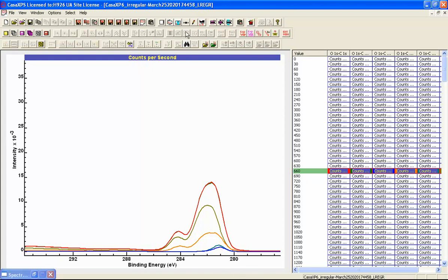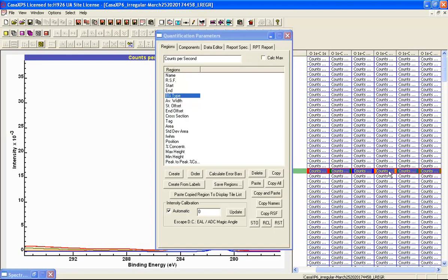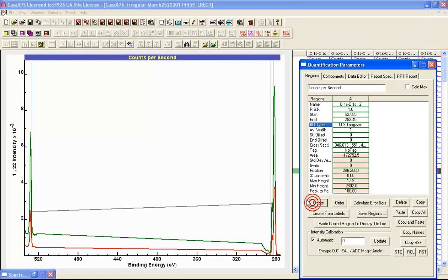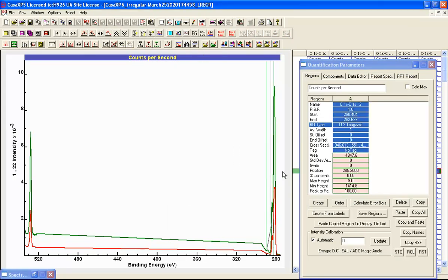To create a depth profile from this data set, we need to define some regions on these data. So let's organize a region for each of these VAMAS blocks that represent the components. Two of these columns are the PVP, so I need to identify PVP columns. Let's display these two in the active tile. So these represent PVP, and we can create a region, and we'll create the region for the different peaks we see here.